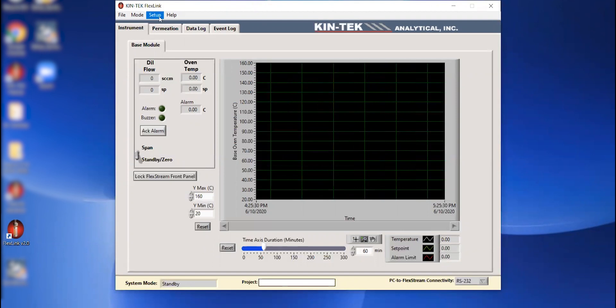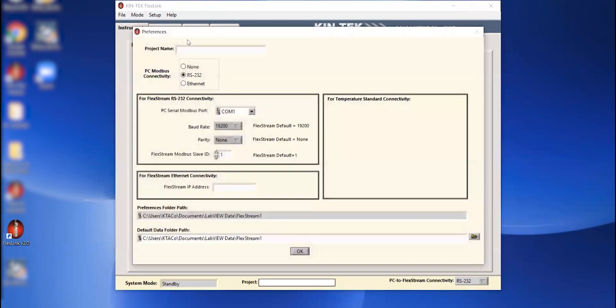We're going to go into setup, setup preferences. In this screen, we can then determine if we want to use the RS-232 to USB connection or an ethernet connection.